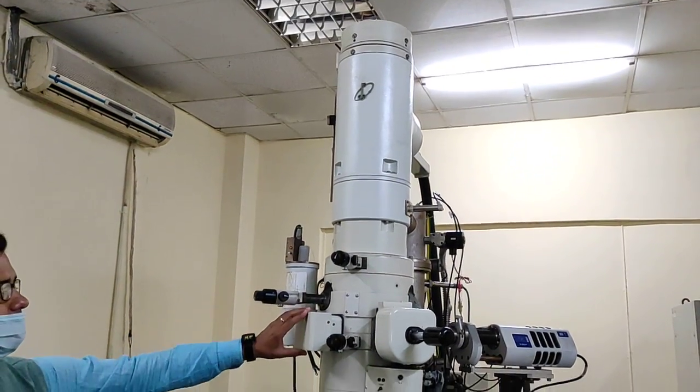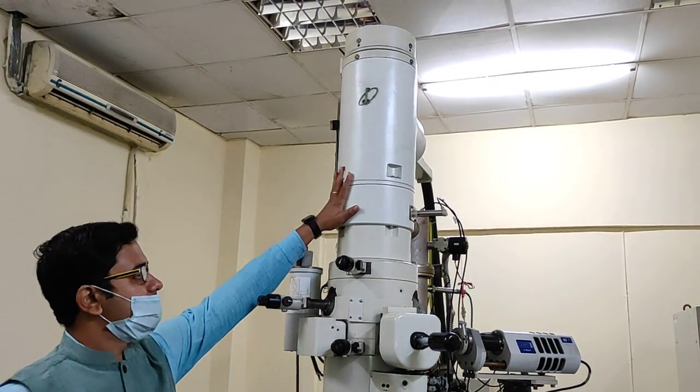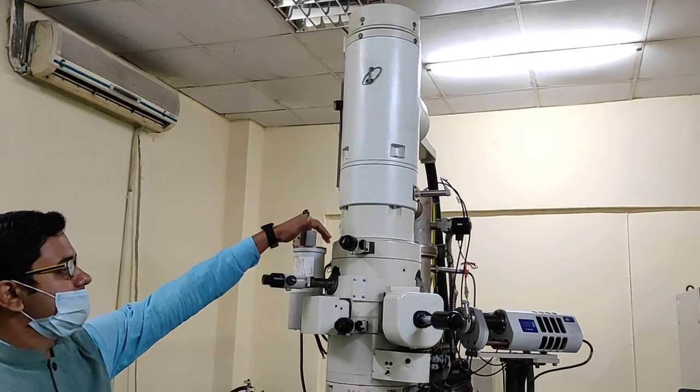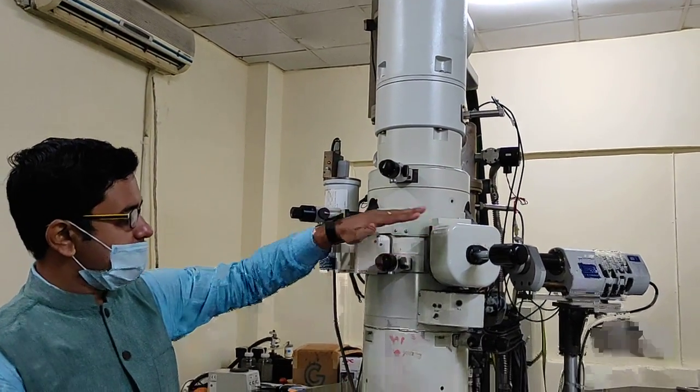This can be divided into three to four units. The first one is the gun where the electron is being generated. This is the upper part of the column through which the beam is coming through to the sample. This is the sample chamber of the stage.